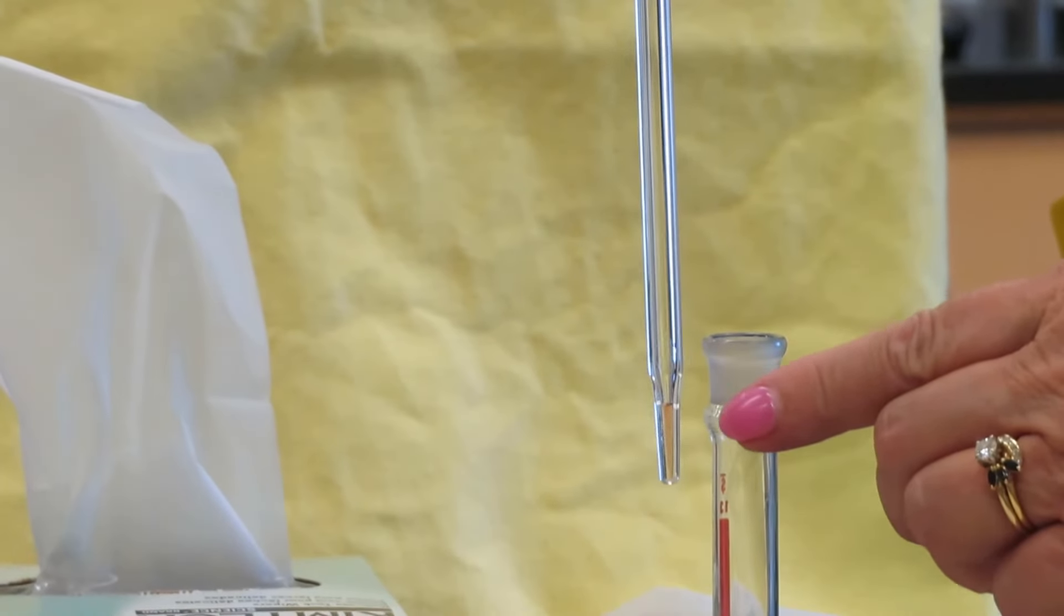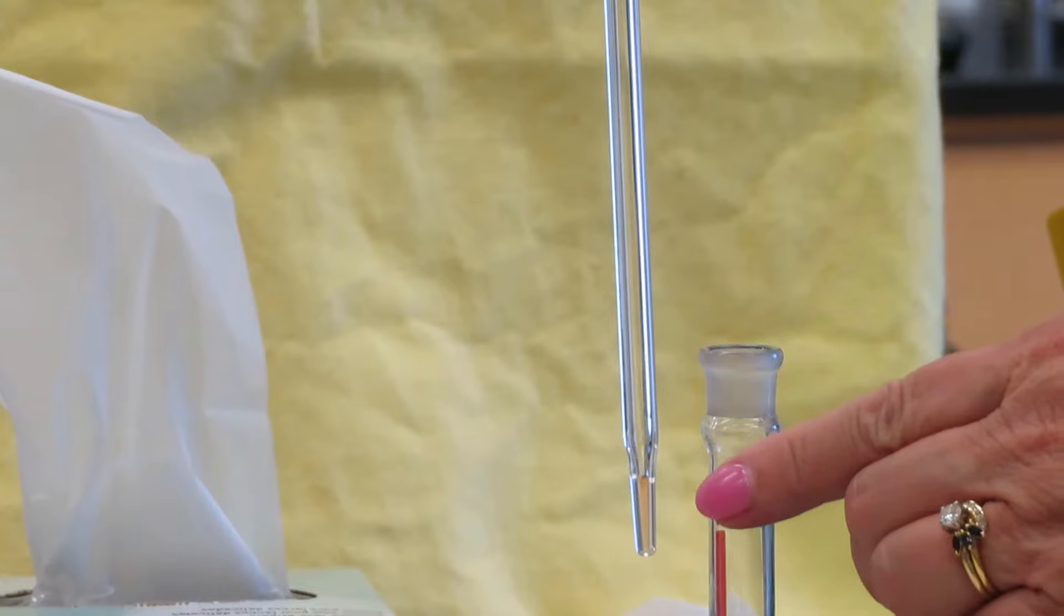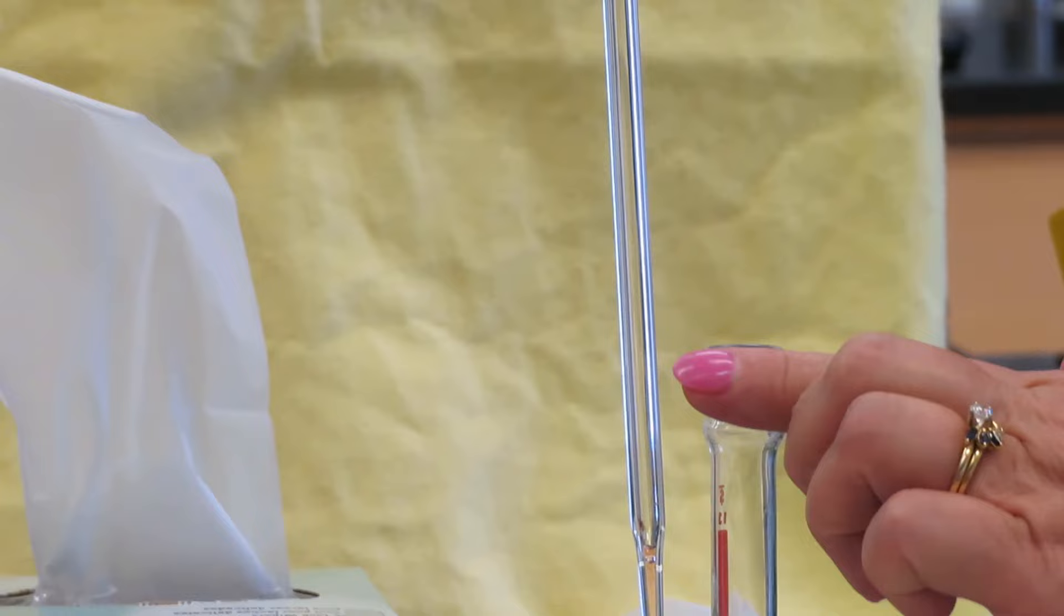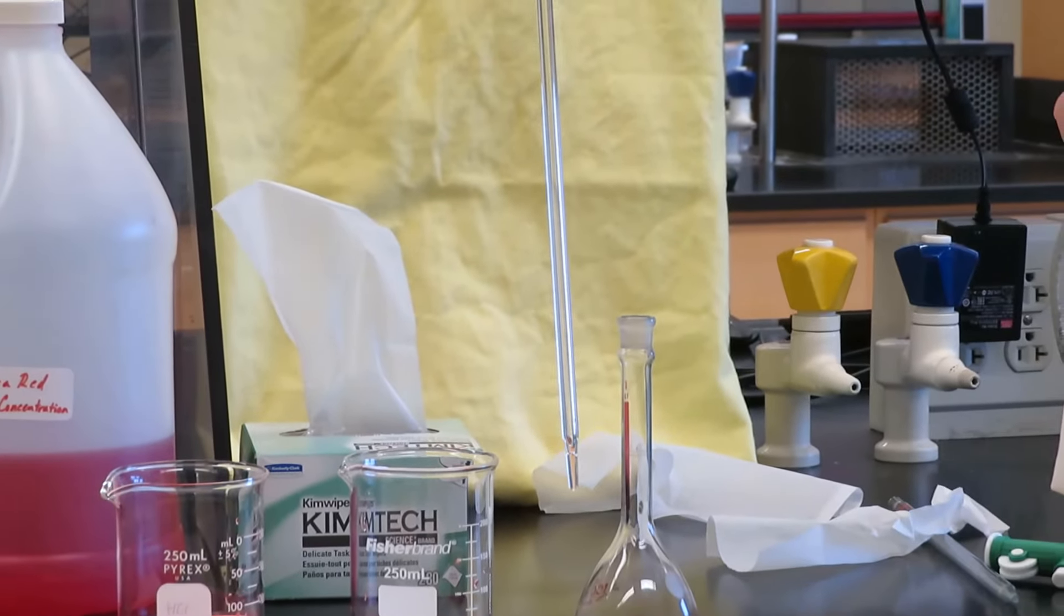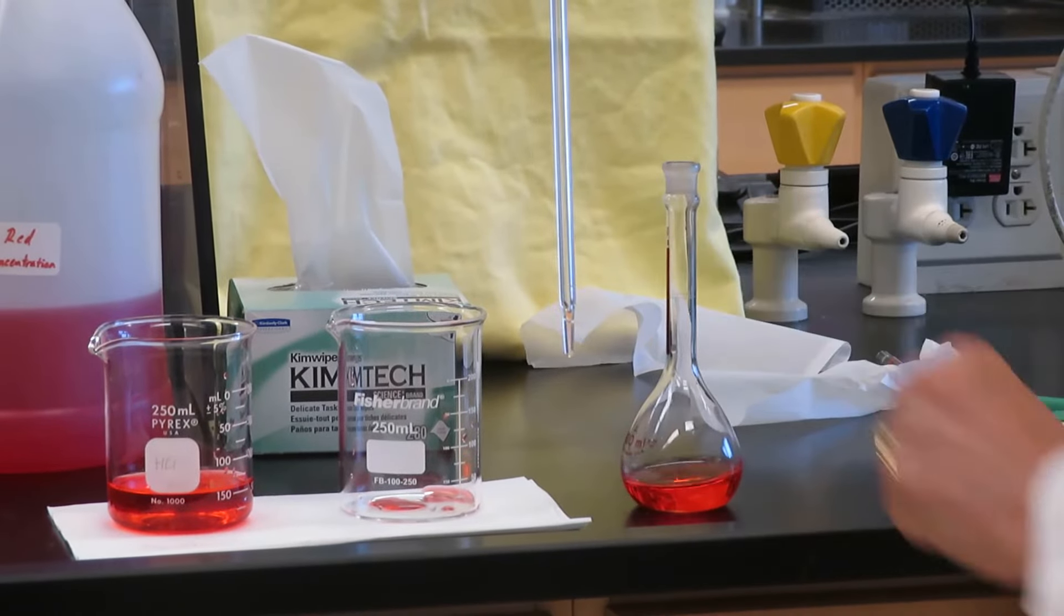You may notice when I'm finished, there's a slight amount of volume in the tip. That's fine, you don't need to blow that out because volumetric pipettes are calibrated to have a tiny amount of volume in the tip when you're finished dispensing. Now I can go on with making my solution.